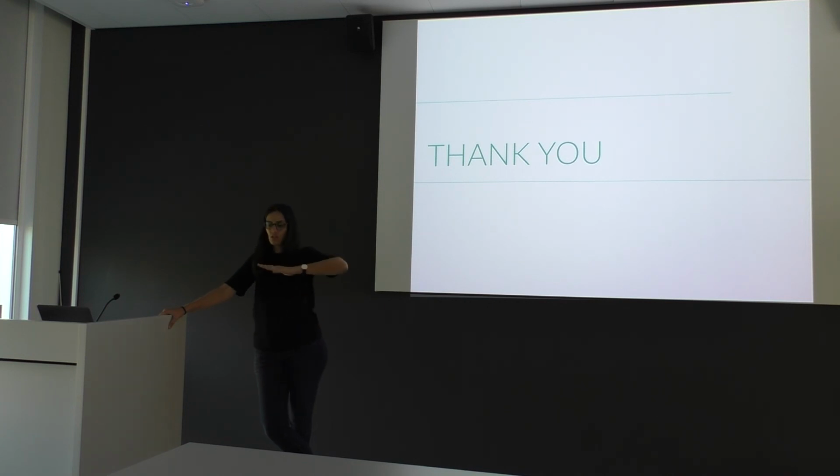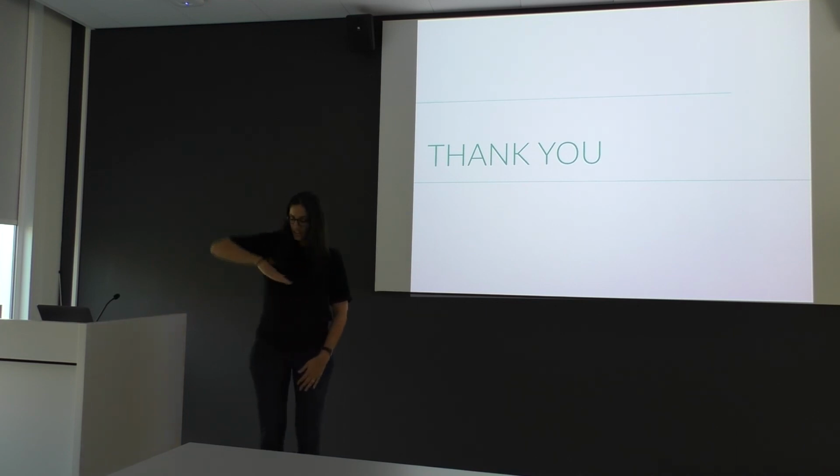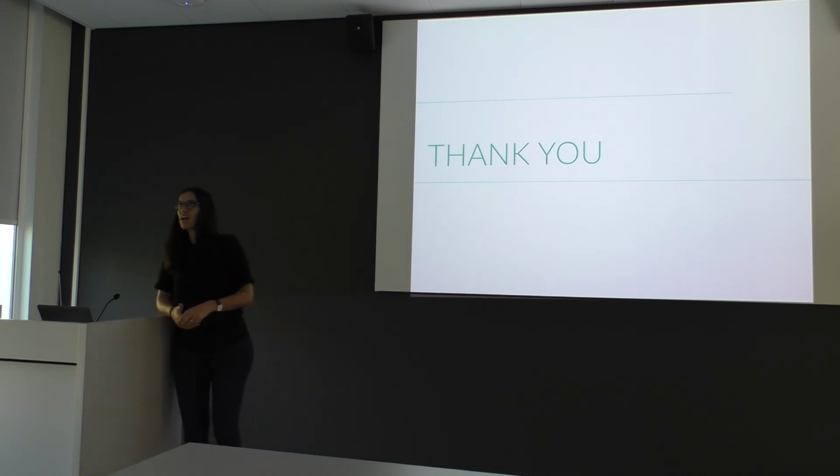The stage, if you tilt, on the Talos Arctica is also a little bit worse. I don't know how much this would influence tomography. If you do the alpha wobbling, you actually see that it doesn't go straight. It goes and then swaps a bit. Why is this?